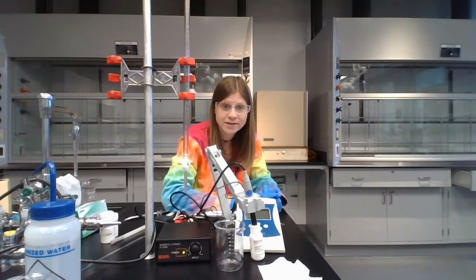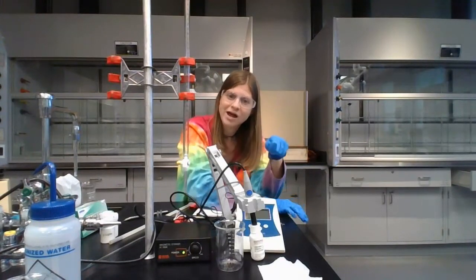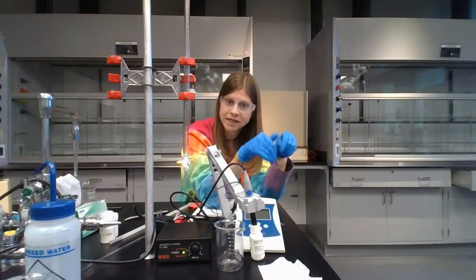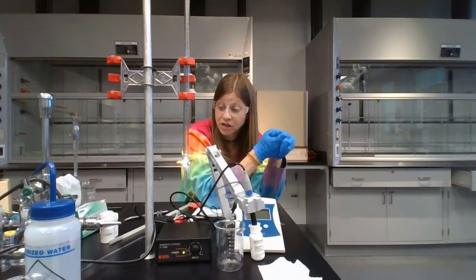So again, no waste container. Everything must be neutralized to a pH of 6, 7, 8, or 9. Your waste is going to be at a basic pH. I bet the pH of your waste container starts at 12. So you can use your pH meter while you neutralize. Just put your pH meter in there and then add your acid. You can even use your stir bar to mix it until the pH gets to that 6, 7, 8, or 9. So that's my suggestion on how you're going to neutralize.